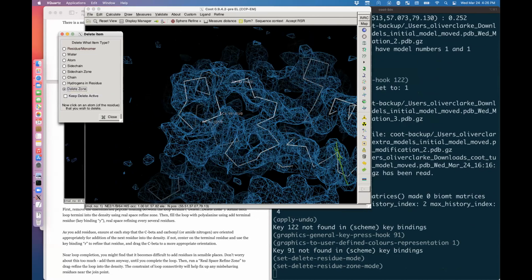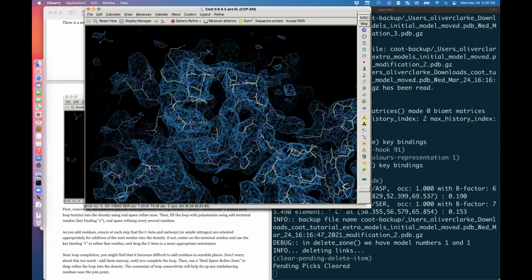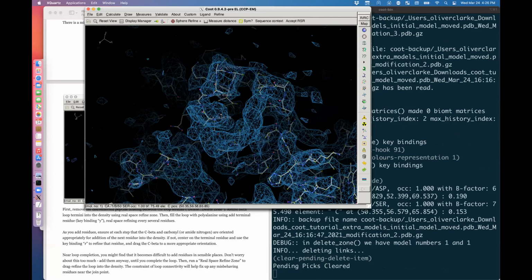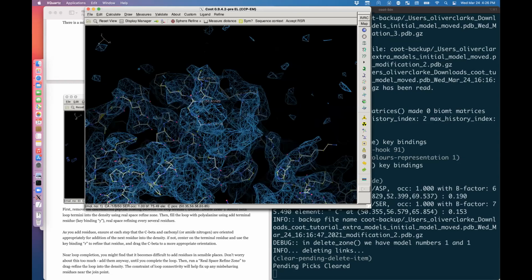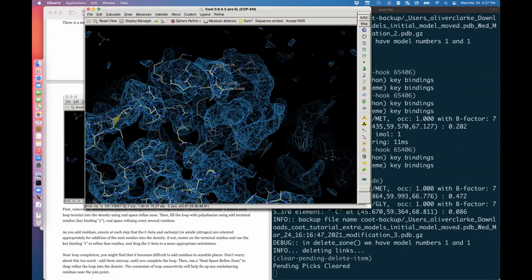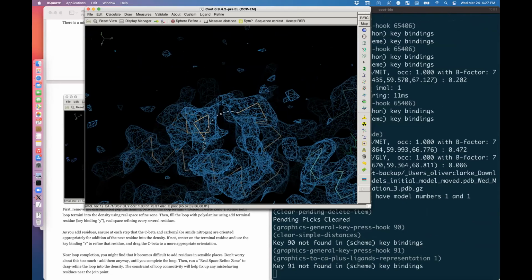So let's delete that zone. That's better. Something that's pretty good.